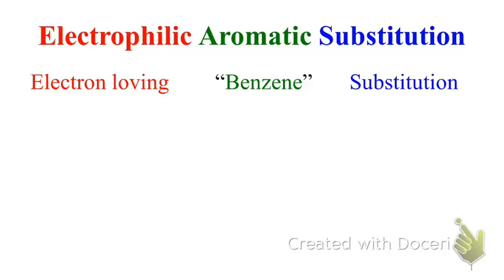I forgot to actually put out this warning for every other section, so you guys will know a little bit more. You are working with concentrated nitric and sulfuric acids. They are extremely corrosive. They will burn you.